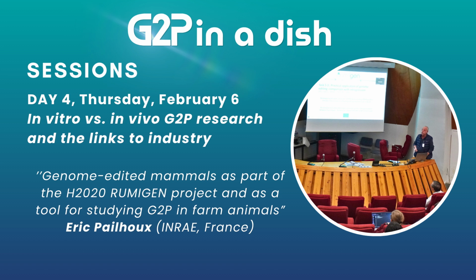The target that we want, the prion gene, has a specific structure that does not hybridize with a single-strand DNA. We changed the DNA in between. The first 5 experiments were done with a single-strand DNA, and then the other 3 with another single-strand DNA. But in both cases, we haven't seen any HDR.